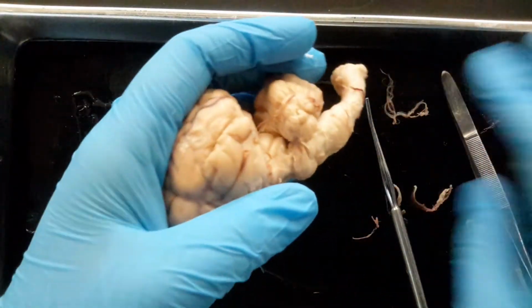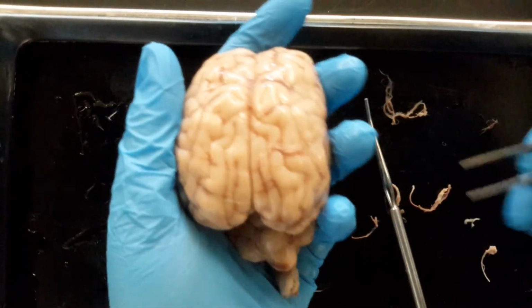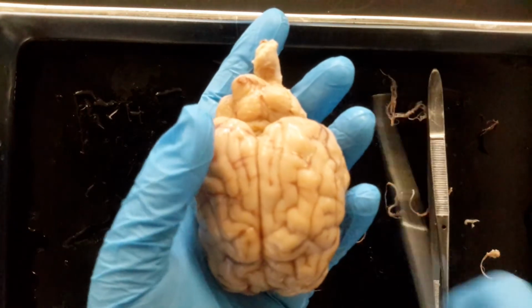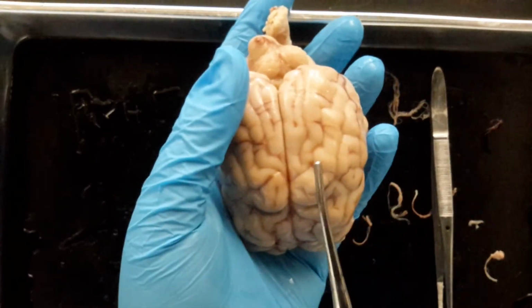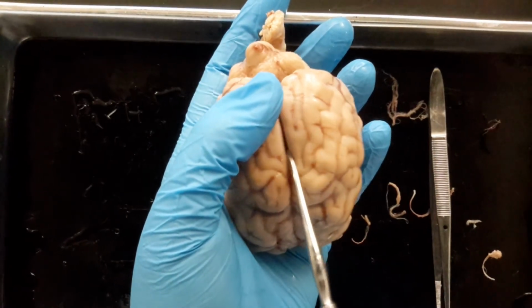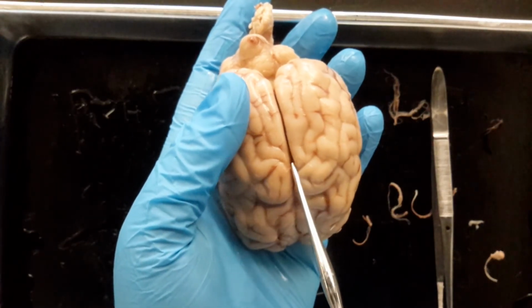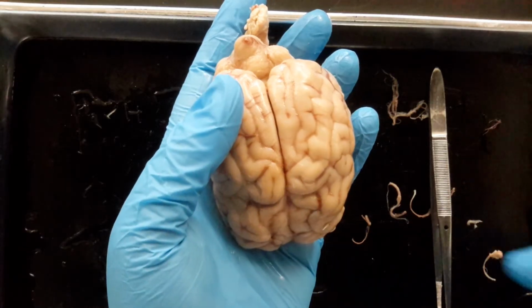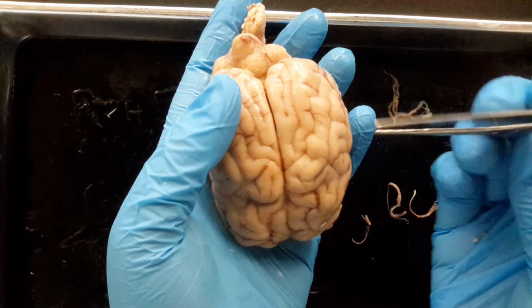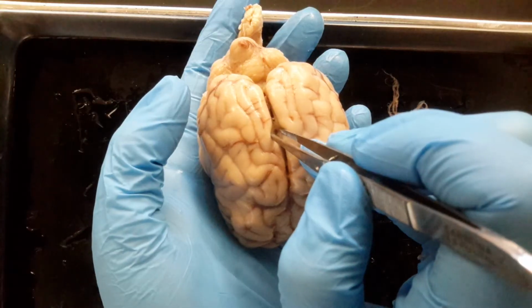A couple other things I'm going to show you, and then I'm going to let you clean. To really see the longitudinal fissure well, there are two things you can do. With a blunt probe, gently pull apart the connective tissue. You have to be very gentle. The tissue is soft and it's easy to break through. If the blunt probe isn't working too well and you're nervous, you can take your tweezers, close them, put them into that little gap and gently open it.